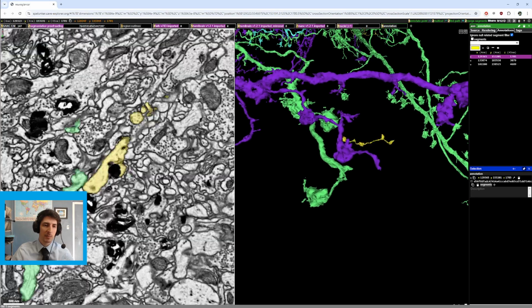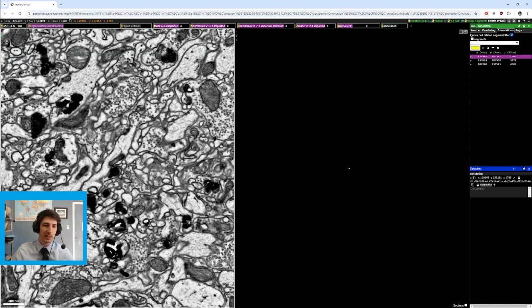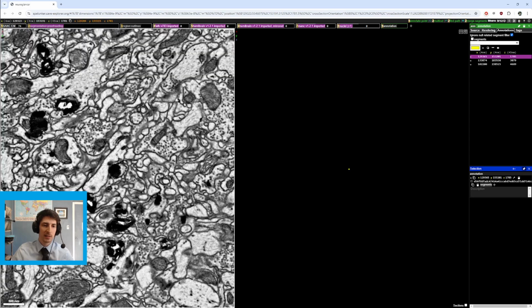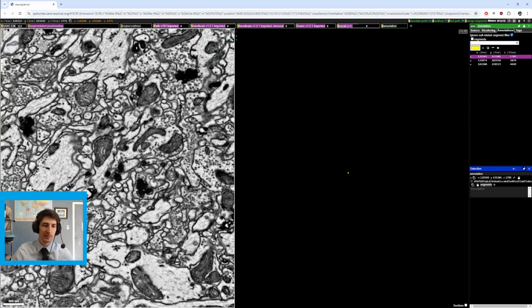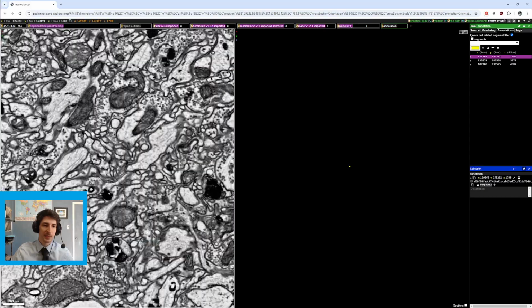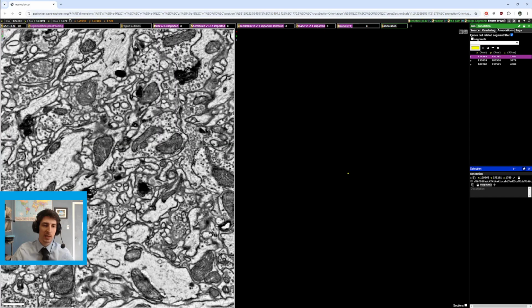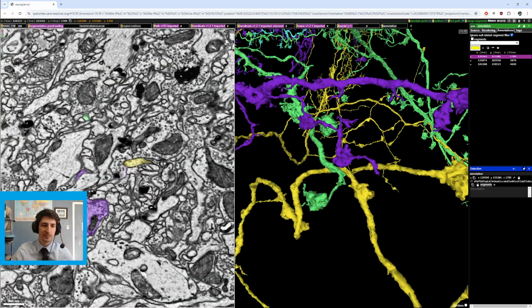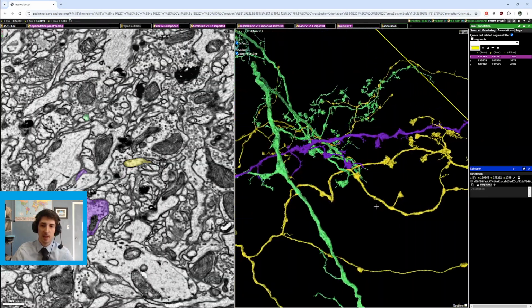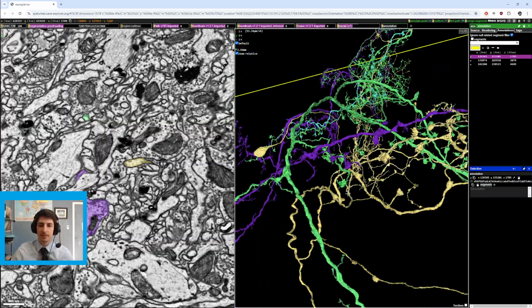So it looks like there's another membrane swirl that is responsible. As you can see, we could follow the ER in here, and you can see this. There's enough of the cell that you can kind of trace it. It gets a little bulged there, but we traced through, and it's the same size, or I should say the same thickness in branch, so we can be pretty confident that this is connected. But when we scroll out, we see that this branch is part of a different cell.